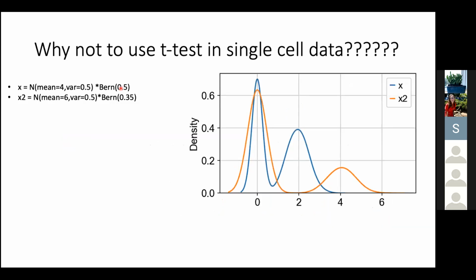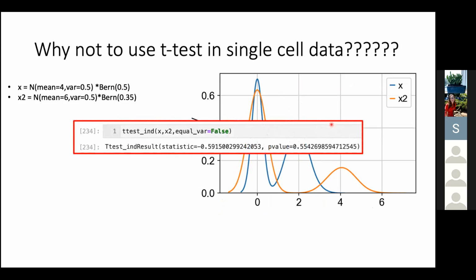Okay, let's go to a different distribution, and I want to make the point right away. These two distributions, to me, look like very plausible gene distribution data, right? There's a 0 and then there's things that are positive. Are these two distributions different? No, they are not. P-value of 0.5. About 3,000 cells, I think, for both, something like that.